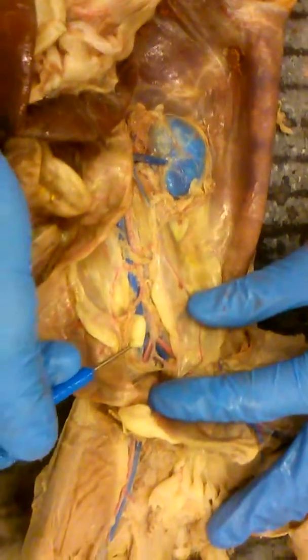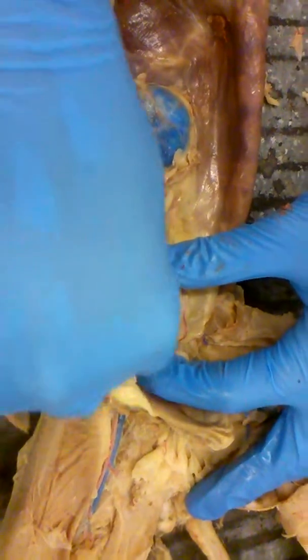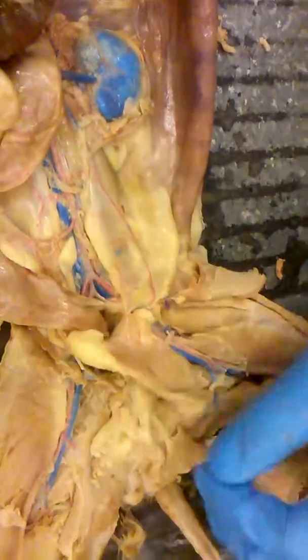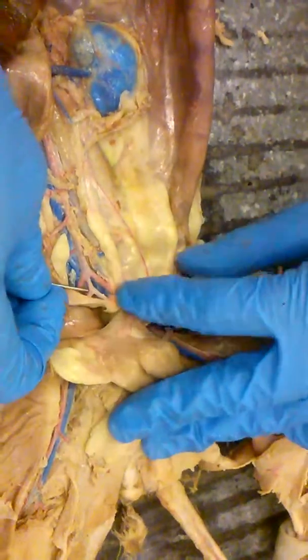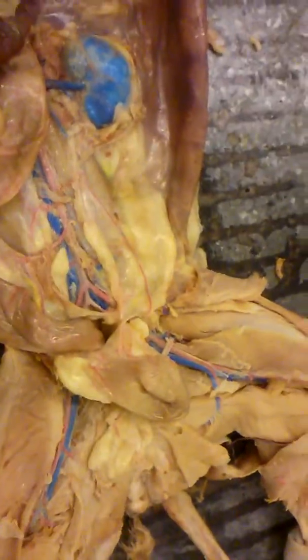So when the aorta gets to the end of the road, is that where they have that? That'll be your iliac. Iliac. Yep. But we don't have a common iliac in the cat. She said. Okay. So it's just the iliac artery. External or internal? I believe she said she wasn't going to do the internal. You don't have to know the internal because they run deep. Yeah. Normally you can't see them. You have to know the external iliac arteries and veins.